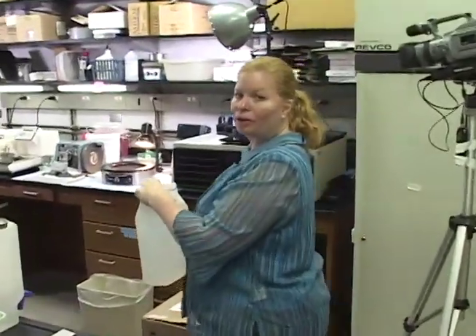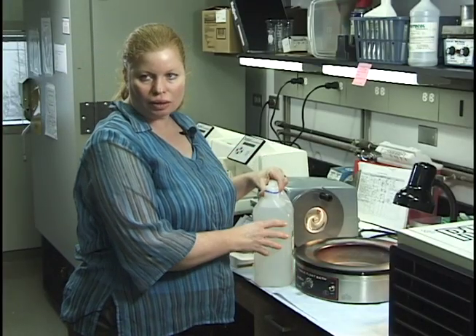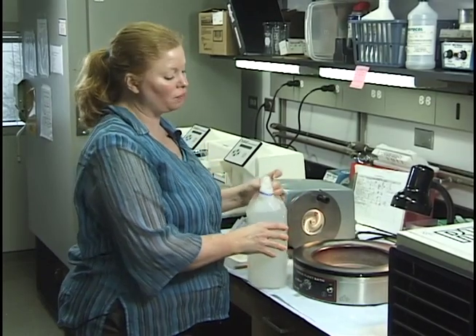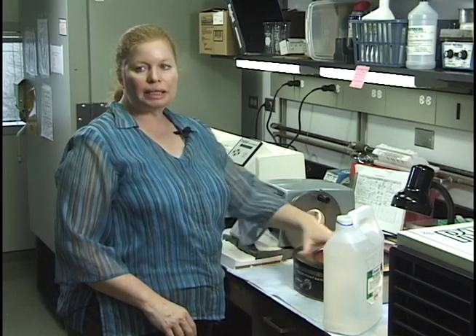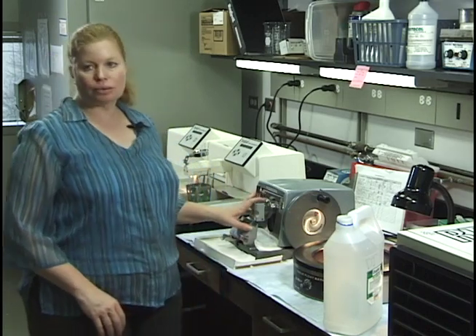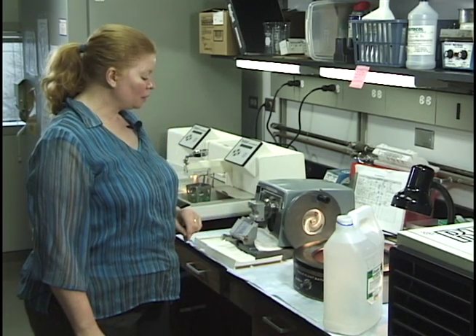Do not use tap water, only RO or DI water. If you're doing RNA studies and you're doing RNA laser cell capture and you're going to do microtoming for RNA, you want to have this completely clean, completely RNase zapped and wiped. RNase zap and wipe this whole unit. Of course, wear gloves, never touch your hair, and the type of water you're going to want to use is DEPC water, or Invitrogen has RNase-free water. But since you don't do that very often, that's for your own information.